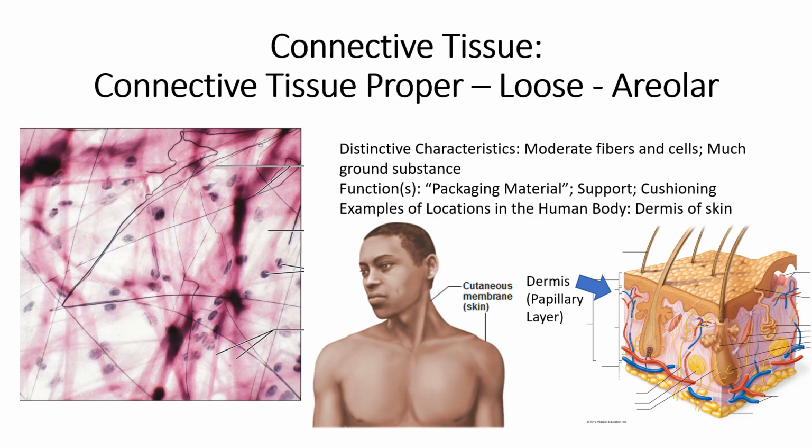All right. The function of this type of connective tissue is to provide support and cushioning, and to be what's sometimes referred to as a packaging material.